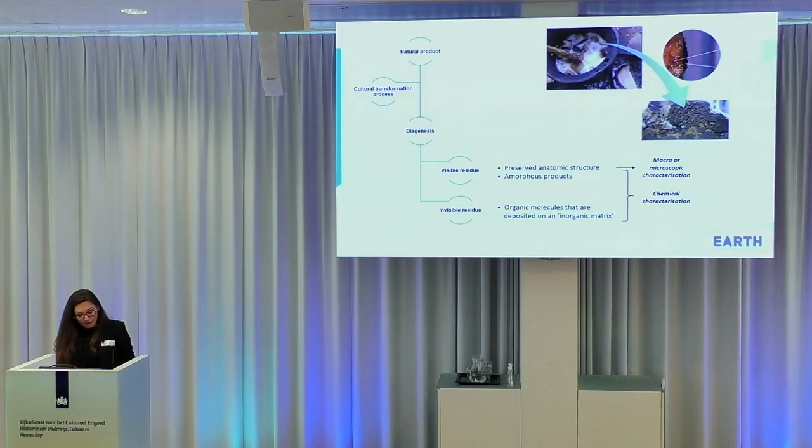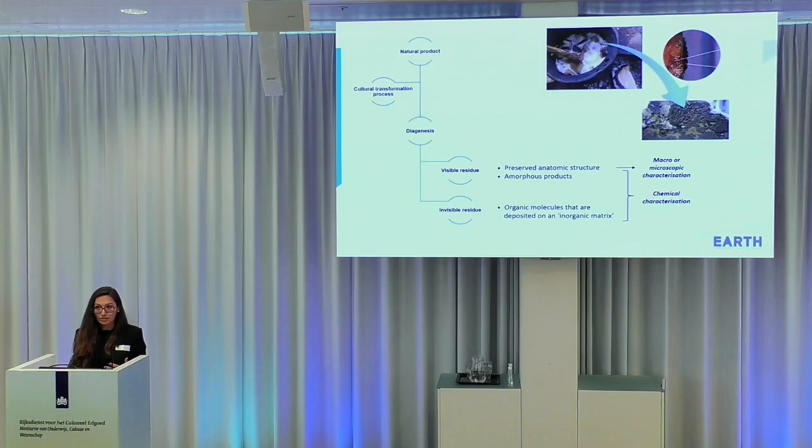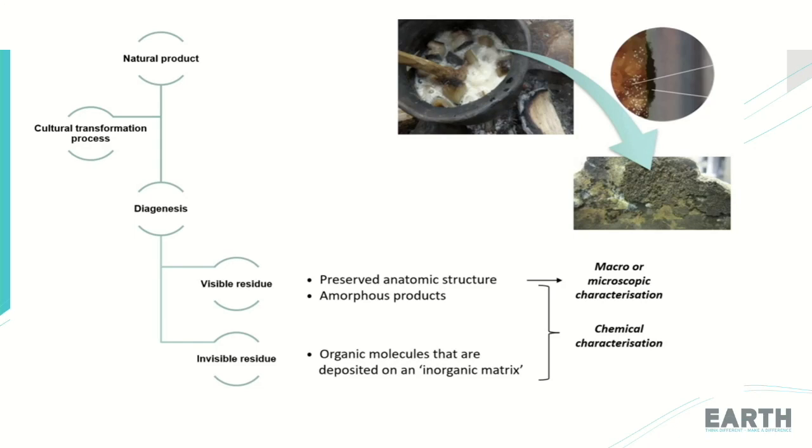So, organic lipid residue analysis actually means that we're working on the food residues that got into the pottery during processing of food, cooking or storing, that are not visible to the naked eye. The visible parts that Lucy explained for you, the food residues, food crust, and lipid residue analysis, we go a bit deeper than that, and we analyze the ones that are not visible to our naked eye. Otherwise, we would not know that they are there.